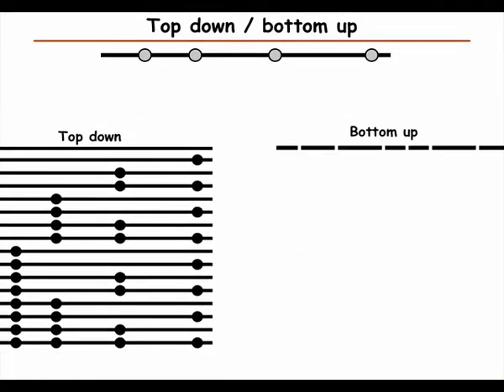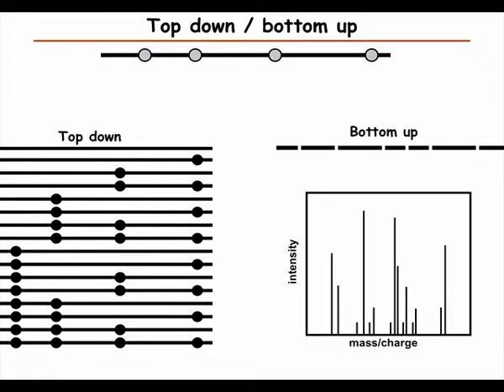So this would be the bottom-up case where we digest, and first of all, we don't see some parts of the proteome, and we also lose the correlation. So we don't know that maybe this protein shifts between 2 states.